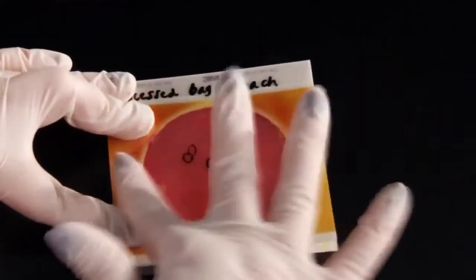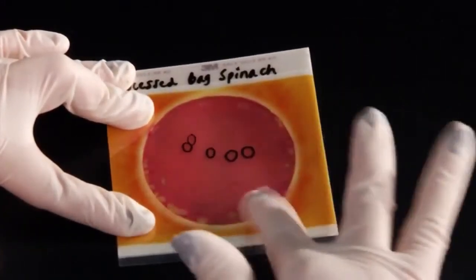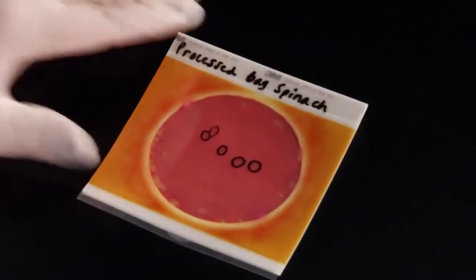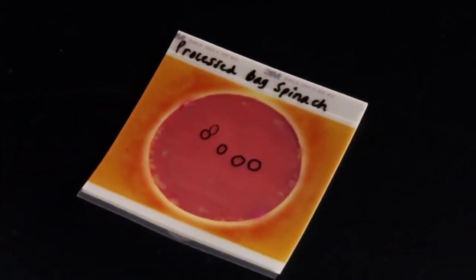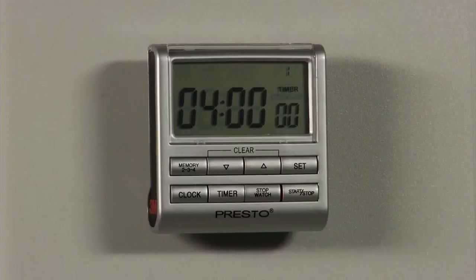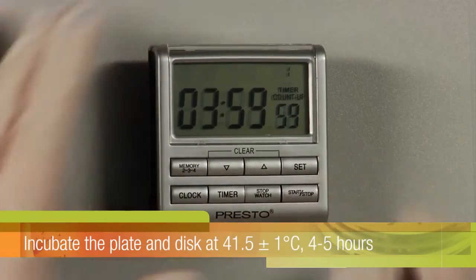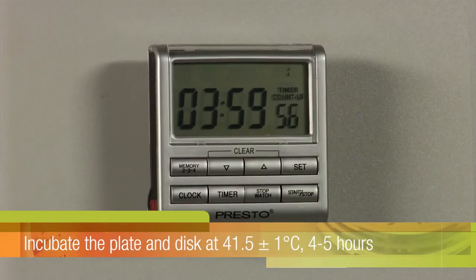Next, gently apply a sweeping motion with even pressure across the top film in order to remove any air bubbles in the inoculation area and assure good contact between the plate's gel surface and the confirmation disc. Incubate the plate and disc at 41.5 plus or minus 1 degree Celsius for 4 to 5 hours.